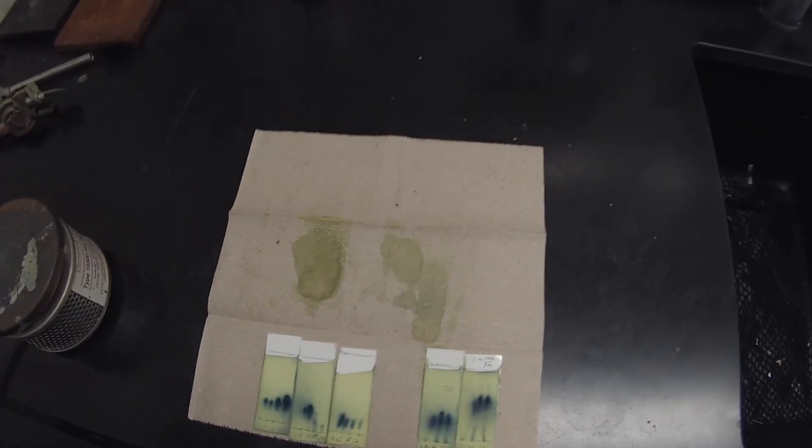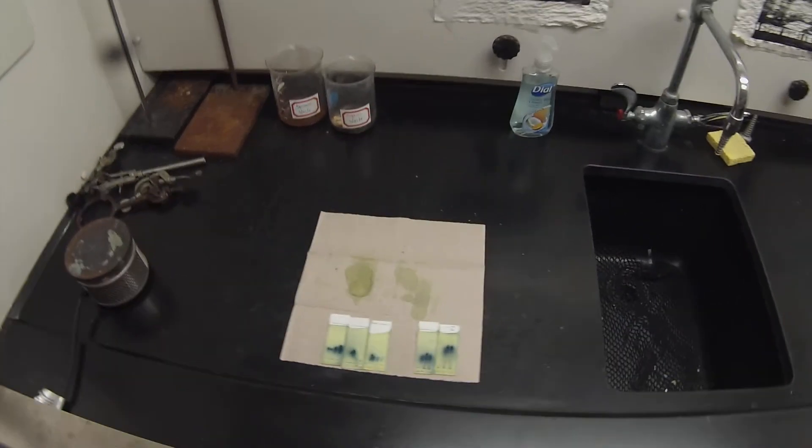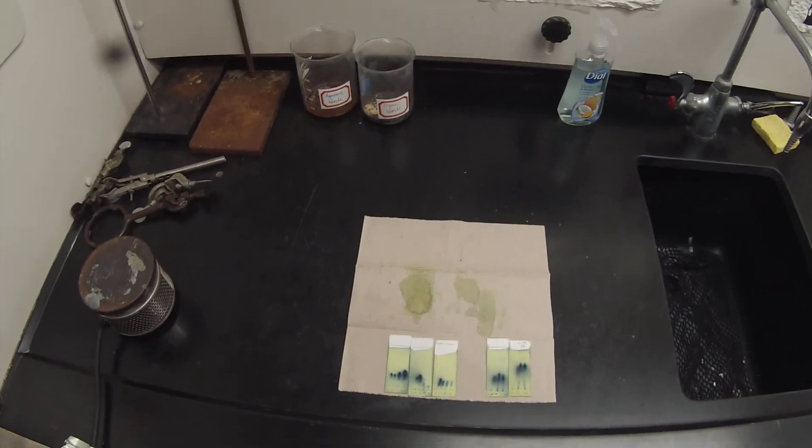And then they're going to be well separated in that solvent mixture. That's it for running the column. And now we can move onto the dehydration.